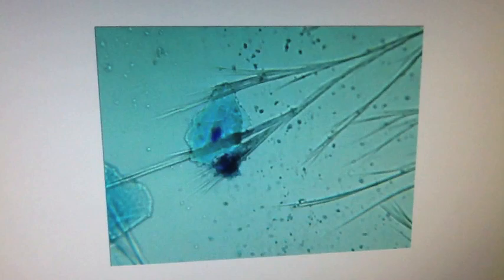Clearly, we have some cell membranes. And cytoplasm, absolutely. Now, don't you dare tell me that you see a cell wall on these cheek cells. No. Don't even think. Here's one cheek cell that we have on high power. It's kind of like hiding behind a bush.